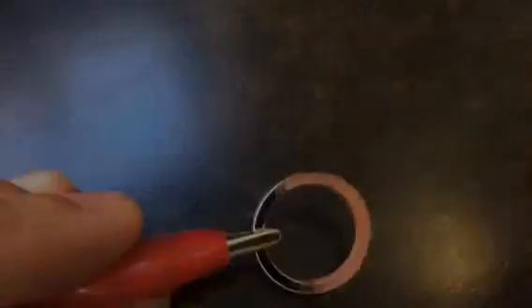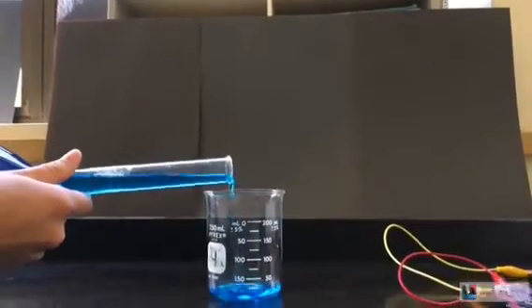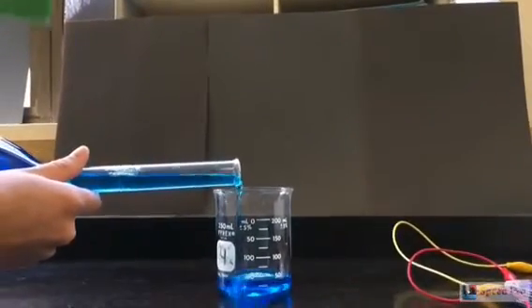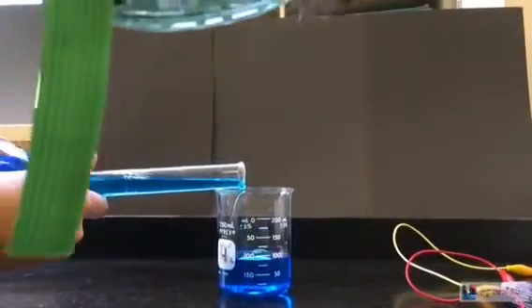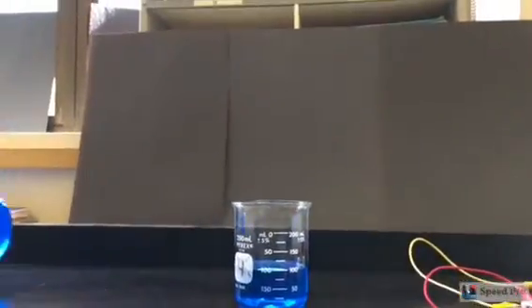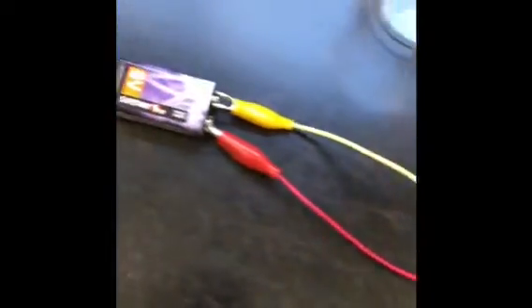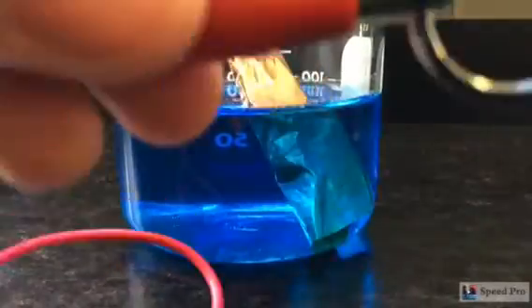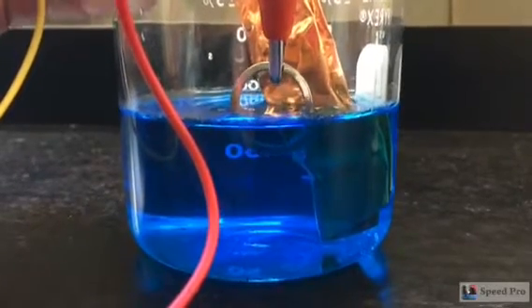To set up an electroplating reaction, you fill a large container with a solution containing the ions of the metal you want to plate your object with. I used the 1 molar copper nitrate solution that I made before, because I wanted to plate my ring with copper. I then took a 9-volt battery and attached a piece of copper foil to the positive terminal of the battery and the ring to the negative terminal of the battery. I then put both the copper electrode and the ring into the copper nitrate solution.